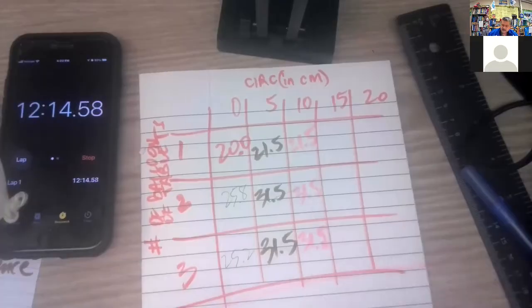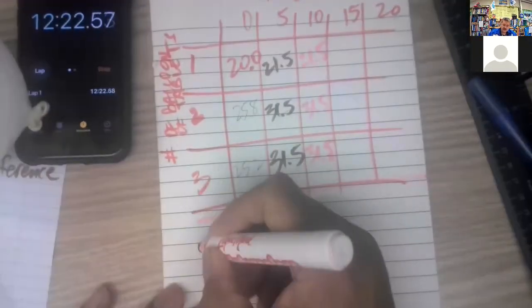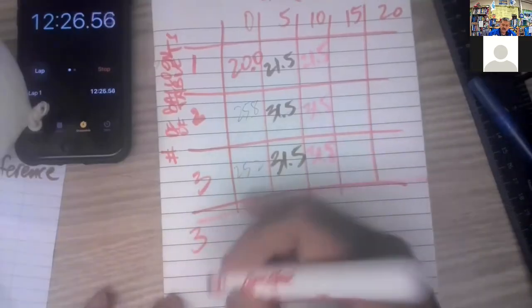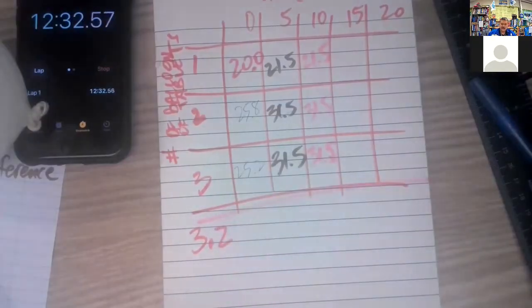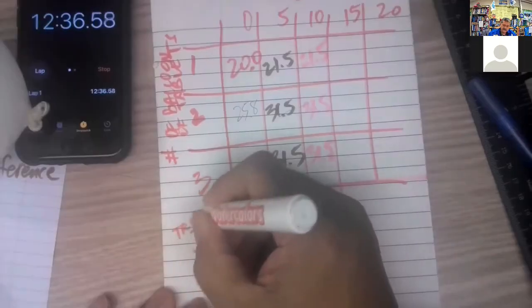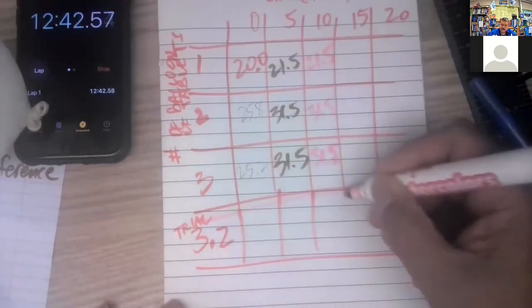This is not part of the procedure, but when you do an experiment, you try something else. So I'm going to call this 3.2. This is trial 3.2. This still has 3 tablets in it, right? 3 the second time.